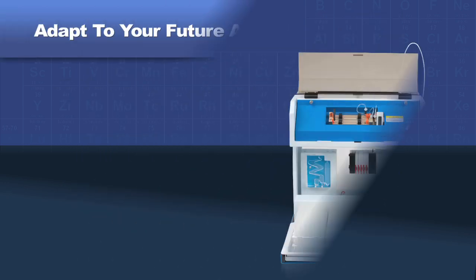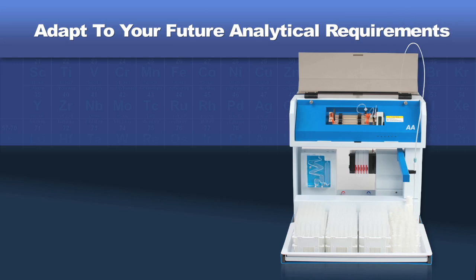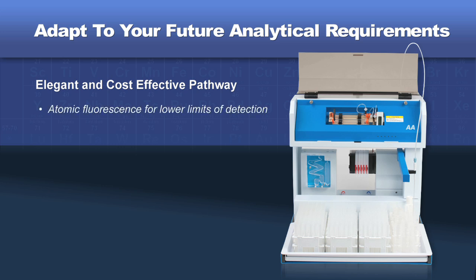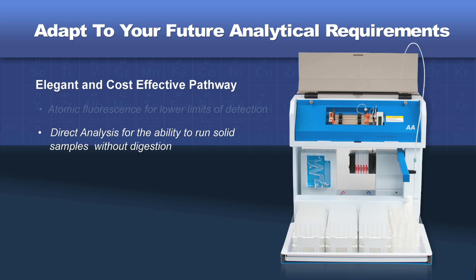The Hydra 2 AA can adapt to your future analytical requirements. It provides an elegant and cost-effective pathway to atomic fluorescence for lower limits of detection, or to direct analysis for the ability to run solid samples without digestion.